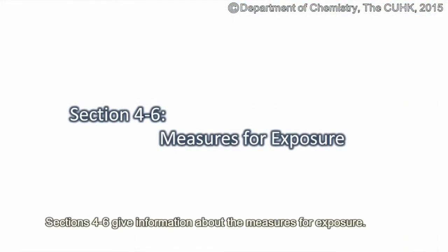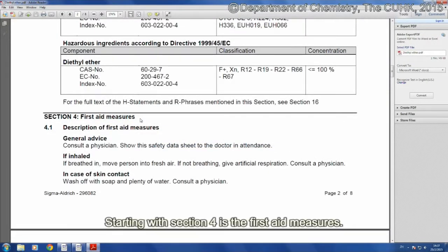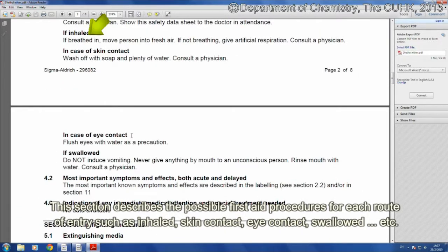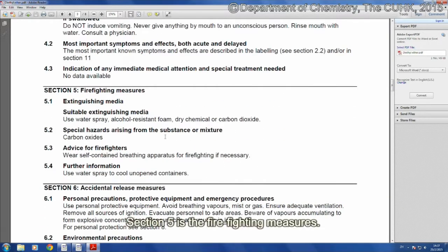Sections 4 to 6 give information about the measures for exposure. Starting with Section 4 is the first aid measures. This section describes the possible first aid procedures for each route of entry, such as inhaled, skin contact, eye contact, swallowed, etc.